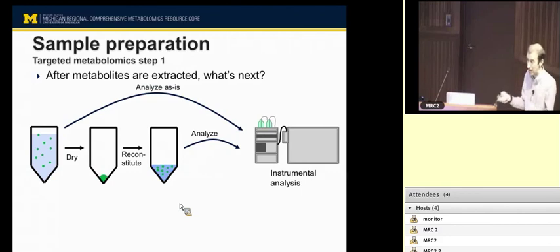It could be synthesized in a lab as a pure compound, but it's not something where there's any degree of ambiguity, like say you were to culture yeast cells and extract something from it, and you thought you probably had something based on the information, but there had been no independent validation. An authentic standard is something that you would buy from a lab with a label on it. You know what it is, and it's been validated by some external source. So we know for sure what it is. It's not a standard that you developed and you think you know what it is. Does that basically answer your question? I think I used more words than needed.